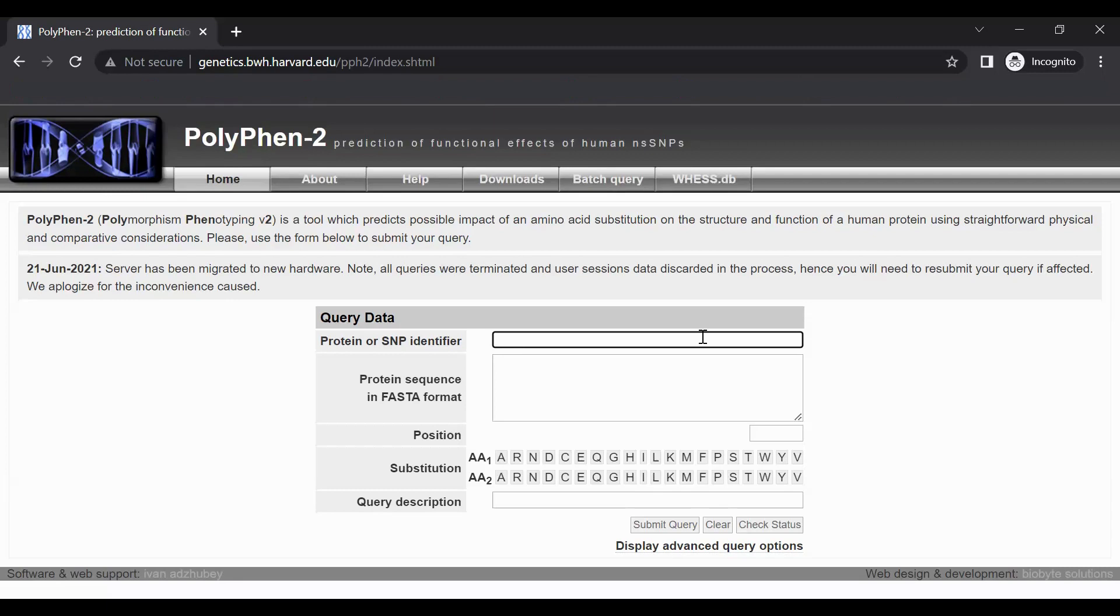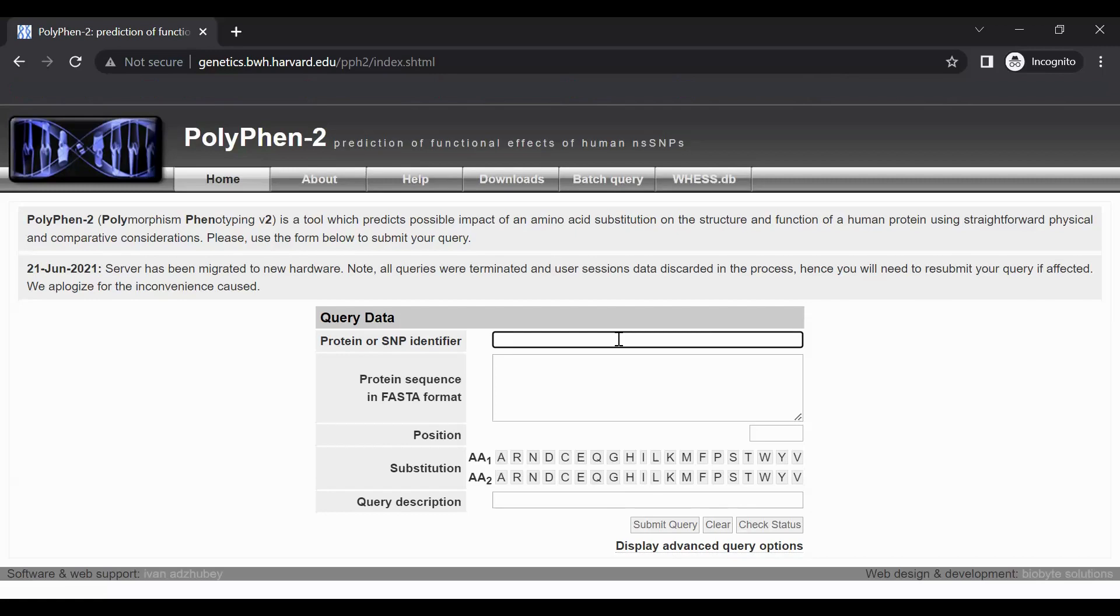We will be investigating a common variant that results in an amino acid change from isoleucine to valine at amino acid number 296 in the TASTER protein sequence. The UniProt-KB entry name for TASTER is T2R38_HUMAN written in all caps, so we will type that protein identifier into the box.